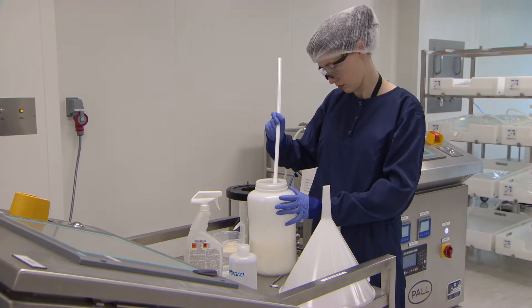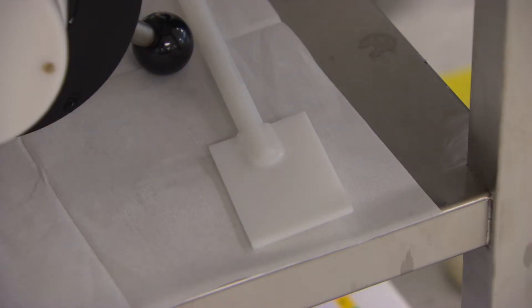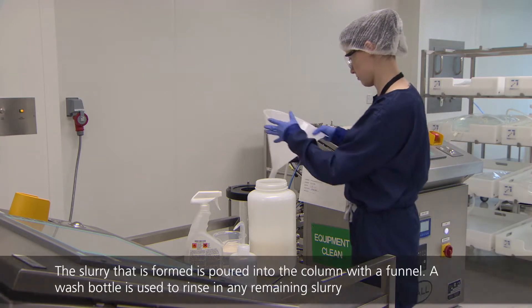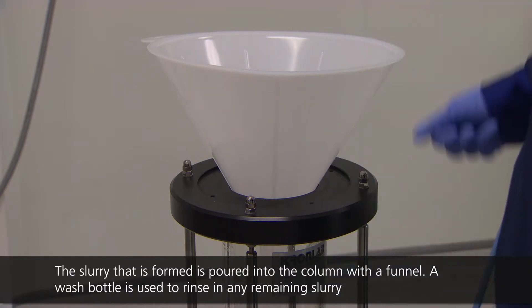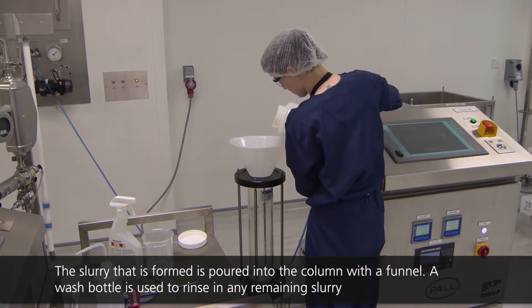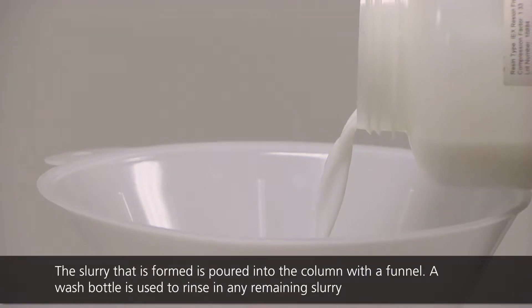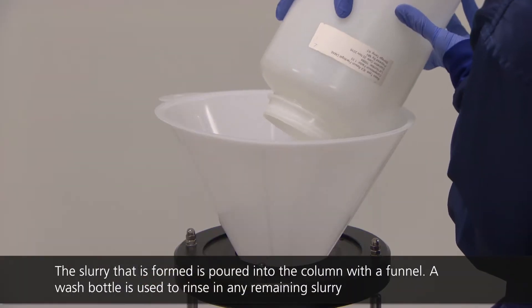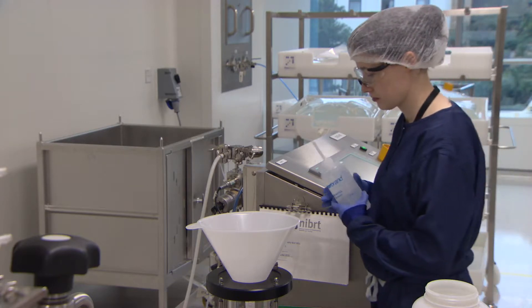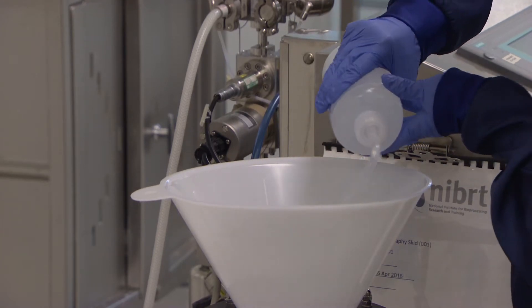Once the resin has been mixed into a slurry, it is ready to be introduced into the column. The operator immediately pours the resin into the chromatography column with the aid of a sanitized funnel. A wash bottle may be used to rinse any resin attached to the funnel or column wall into the column.